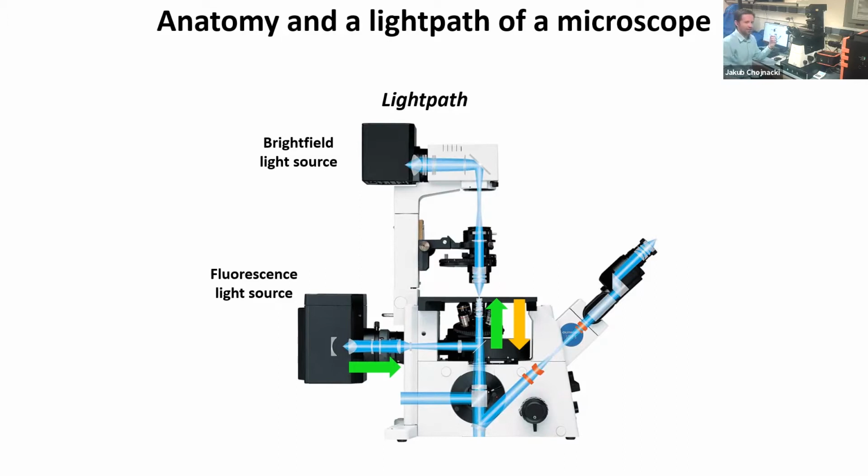Afterwards, when you excite the fluorescent molecules, the same objective collects the fluorescence that is being emitted by the excited molecules. And the same light, as you can see on the arrow, travels down. Then we can direct it either to the ocular, to see it, or to the detectors, very high sensitivity fluorescent light detectors.